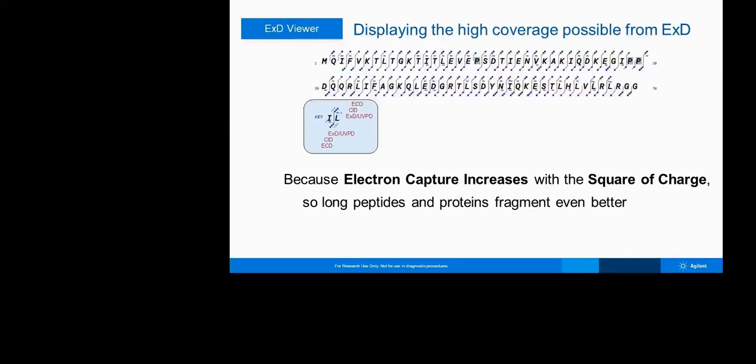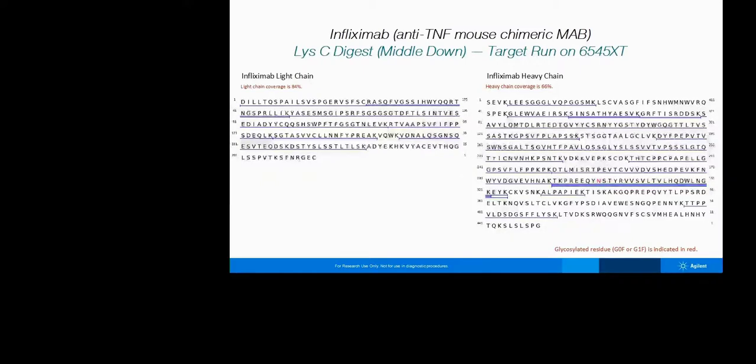And if you look on the top panel, you're looking at the Z ions coming from the other direction. So you can easily visualize the types of fragmentation that are occurring. There are also some CID peaks in there, and there's fragmentation that generates A ions that is also present in the spectrum. The other thing we did is add tilde marks here to indicate that you have side chain fragmentation.